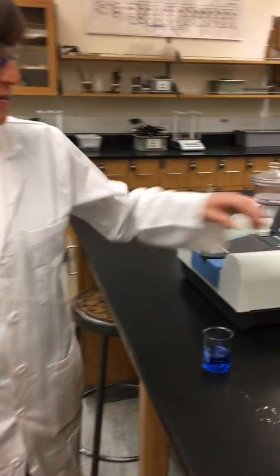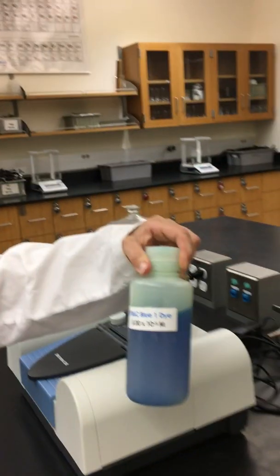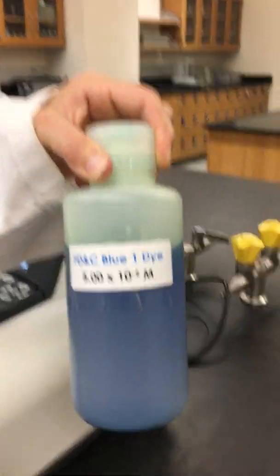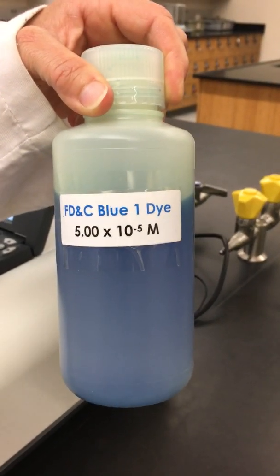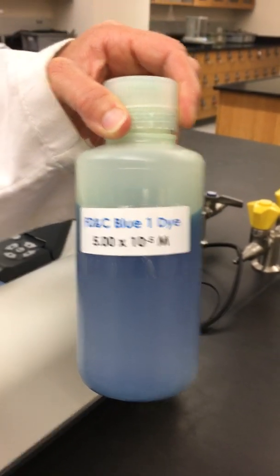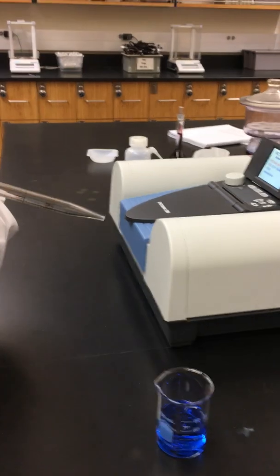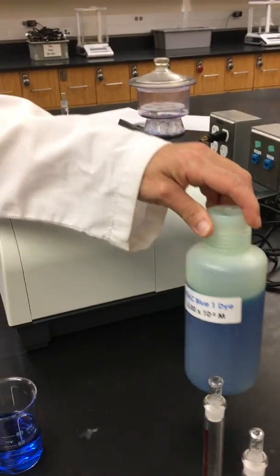We have FD&C Blue Dye number 1, and the concentration of the stock solution is 5.00 times 10 to the negative 5 molar concentration. So I've poured this into a beaker because remember we never want to put pipettes or things into our source container.